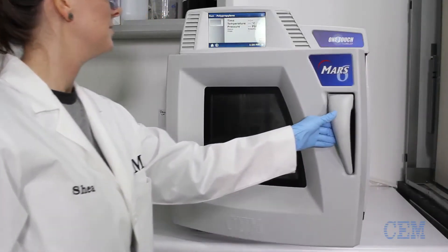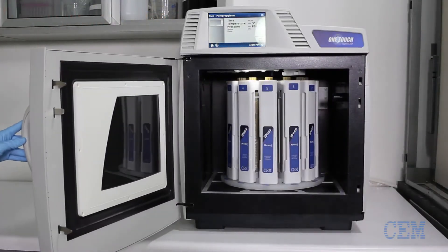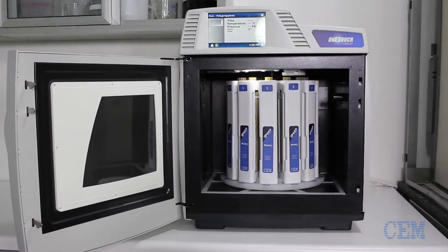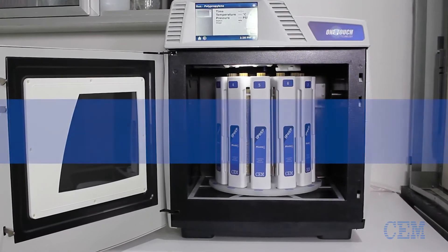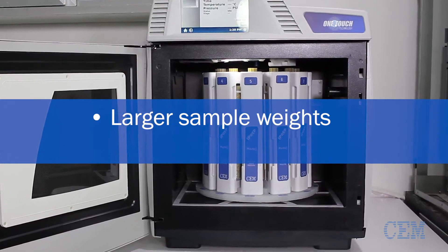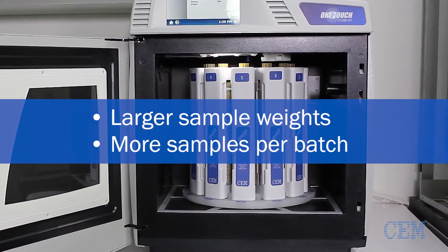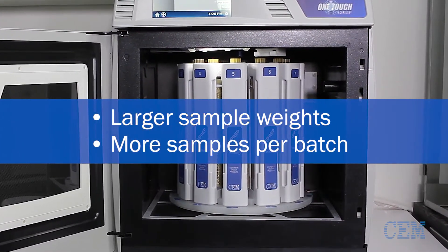CEM introduces the I-PREP vessel. The I-PREP is a new vessel design that provides two major benefits: the ability to handle larger sample weights and the capability to run more samples per batch than any other high temperature and pressure vessel.